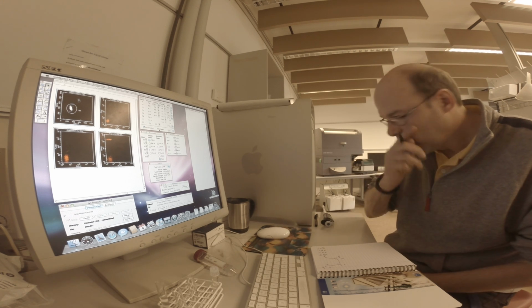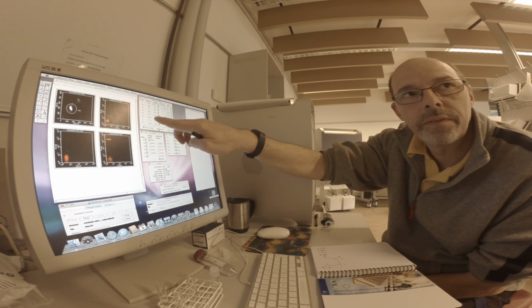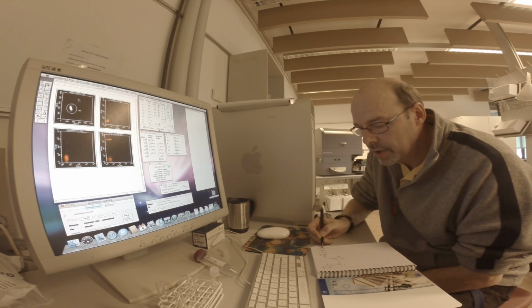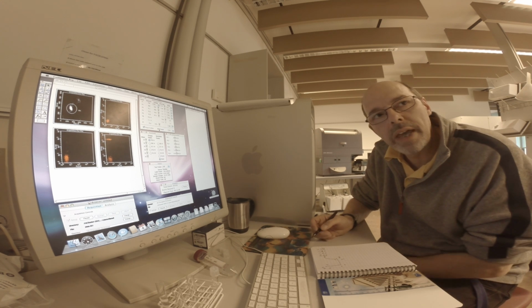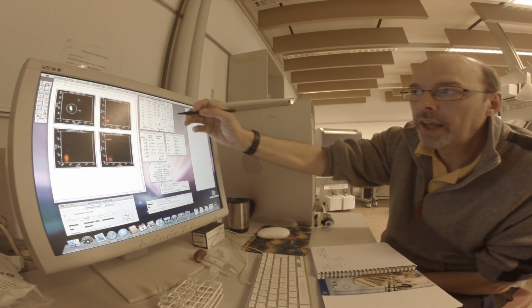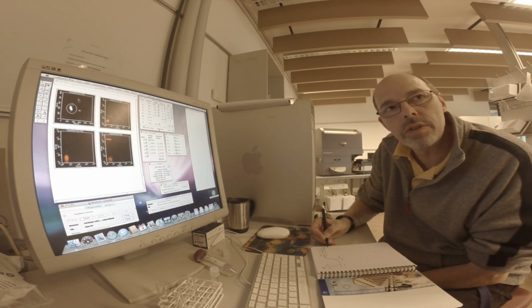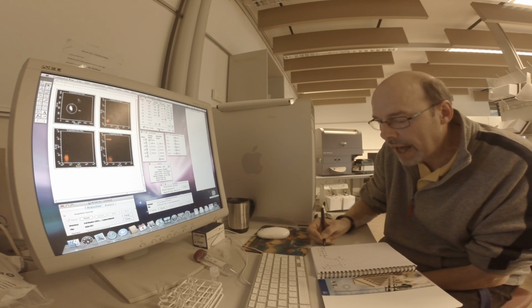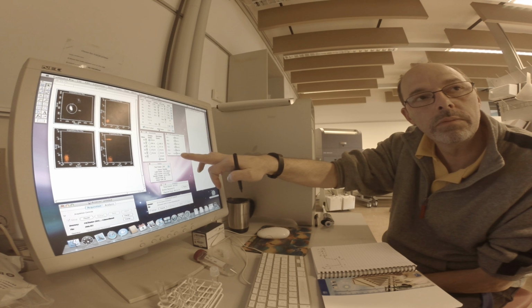Okay. So when we increase the sensitivity, that is the same as increasing this number. Yes. So the question is if we could just make the equation that every time you move this one up, you add a little bit to this value. Yeah. And then this value is run through the compensation matrix.